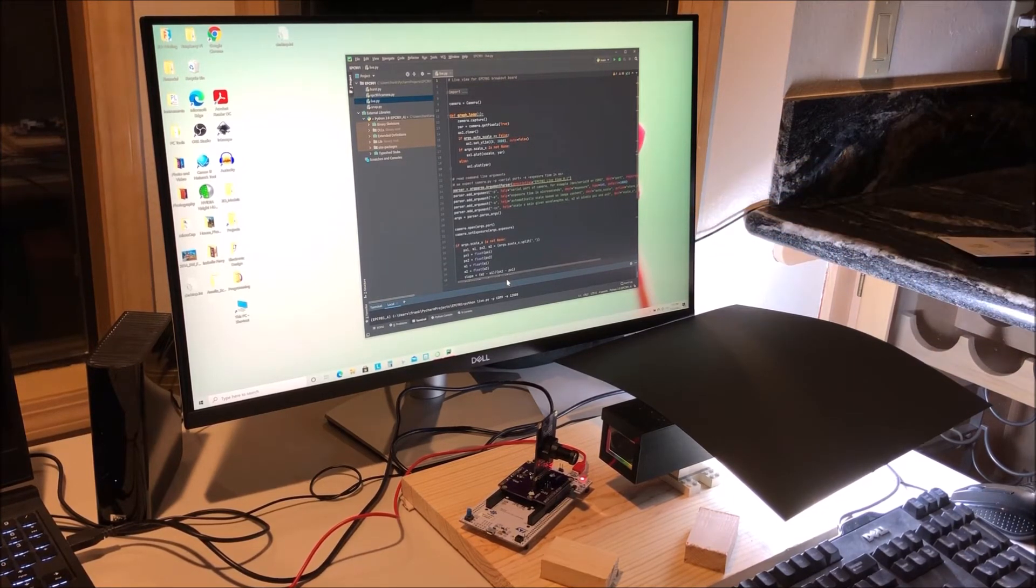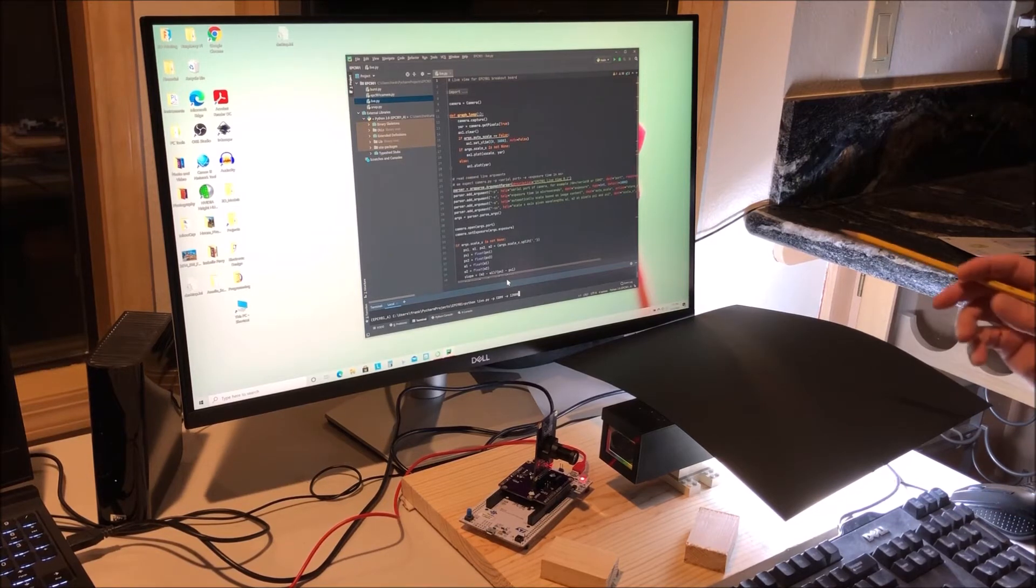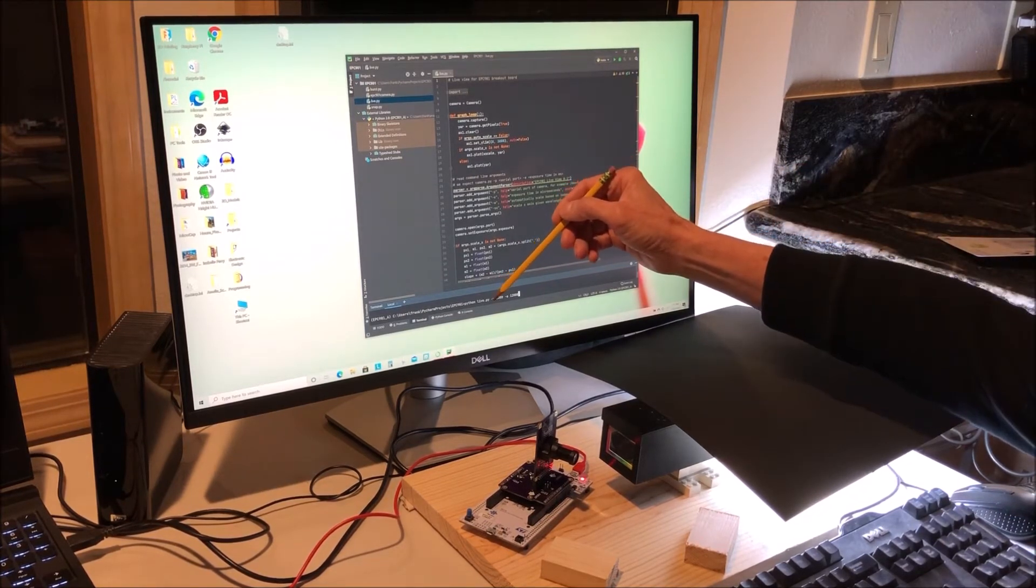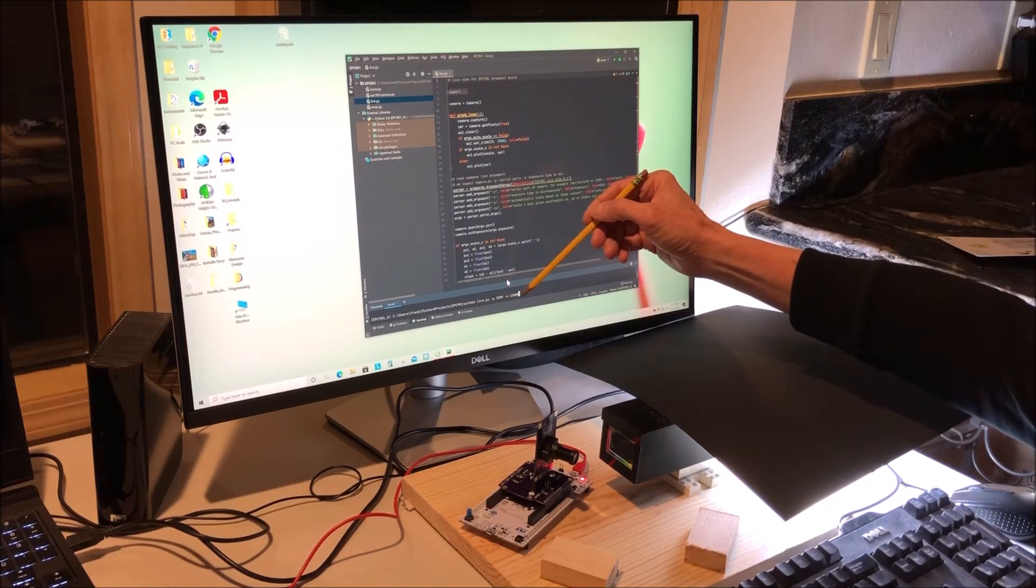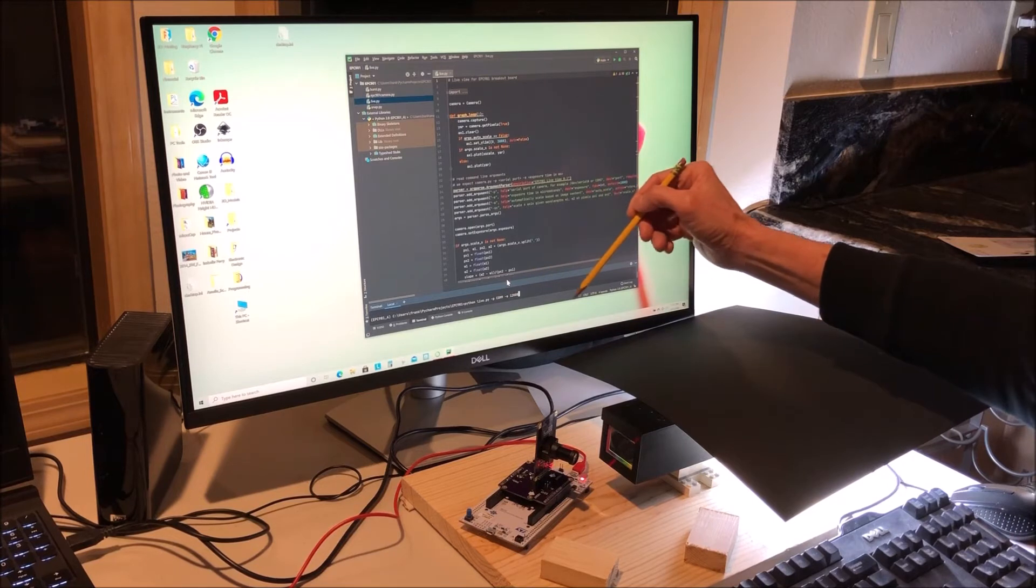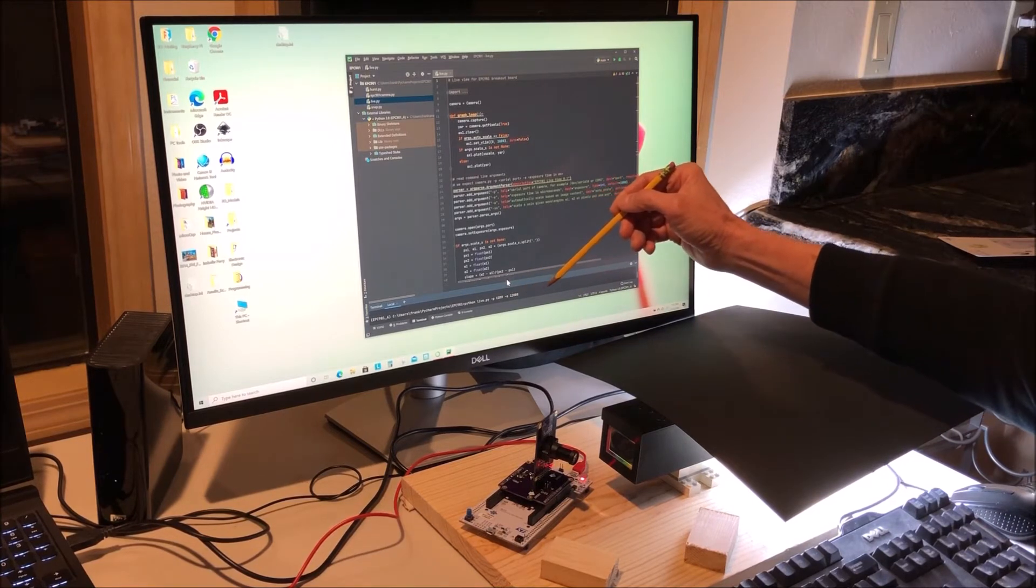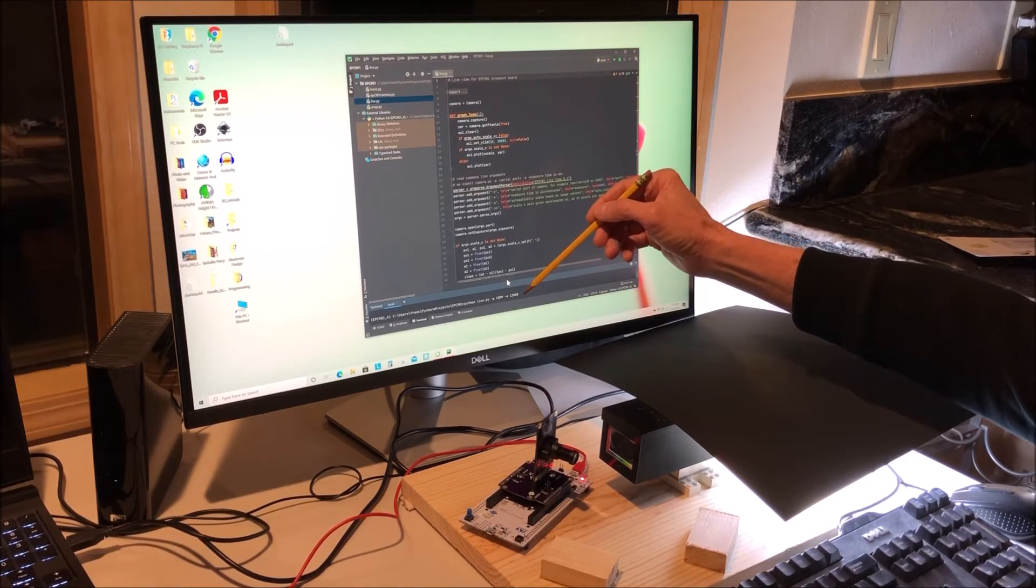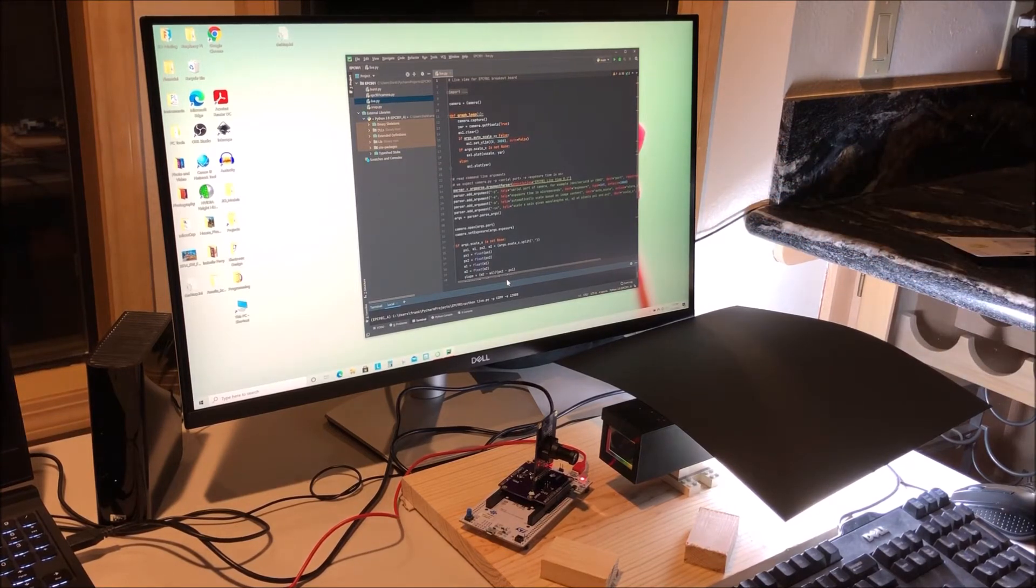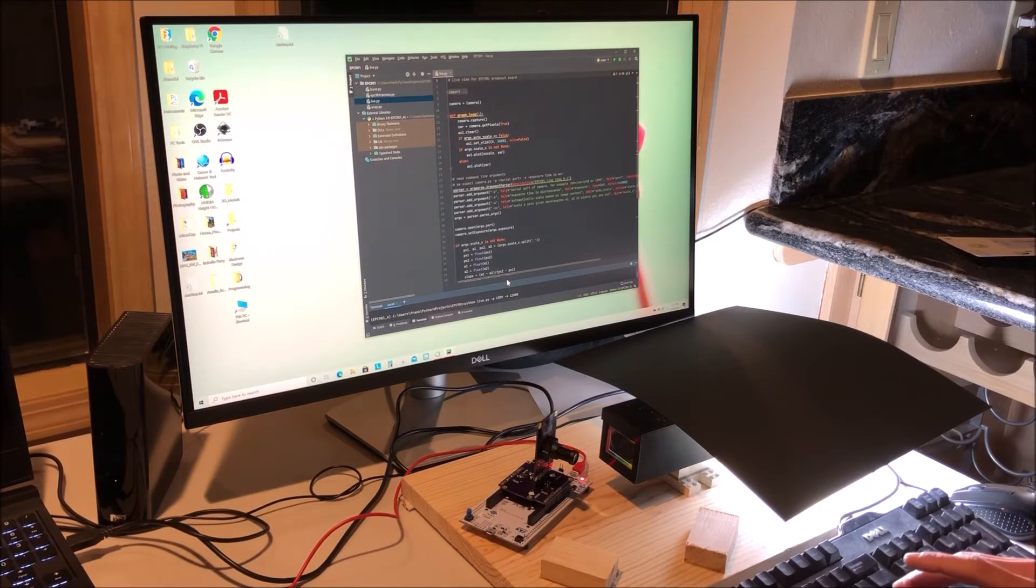The script that I'm running down here has two arguments required: the port dash p which on my Windows machine is comm 9, and the exposure dash dash e which is set at 12,000 or 12 milliseconds. So with that let me just run it and let's have a look.